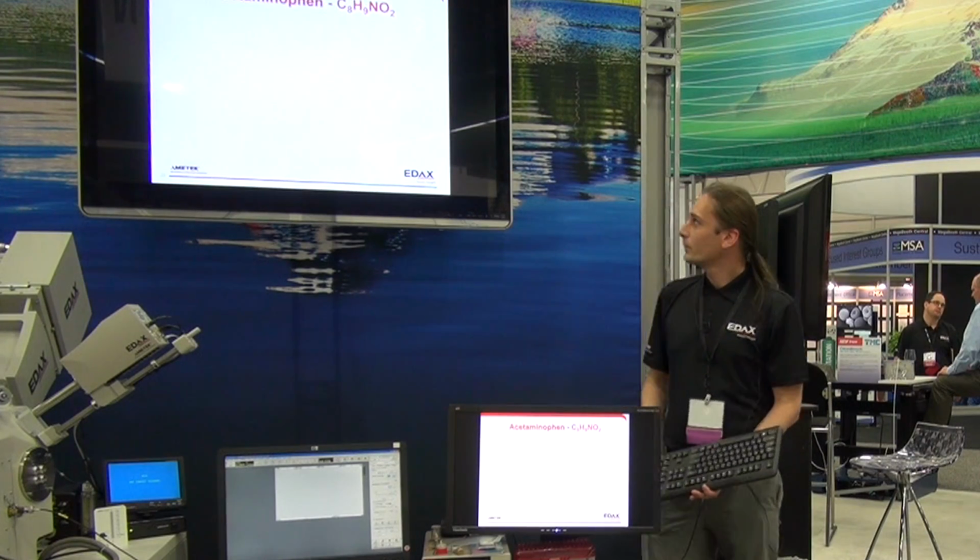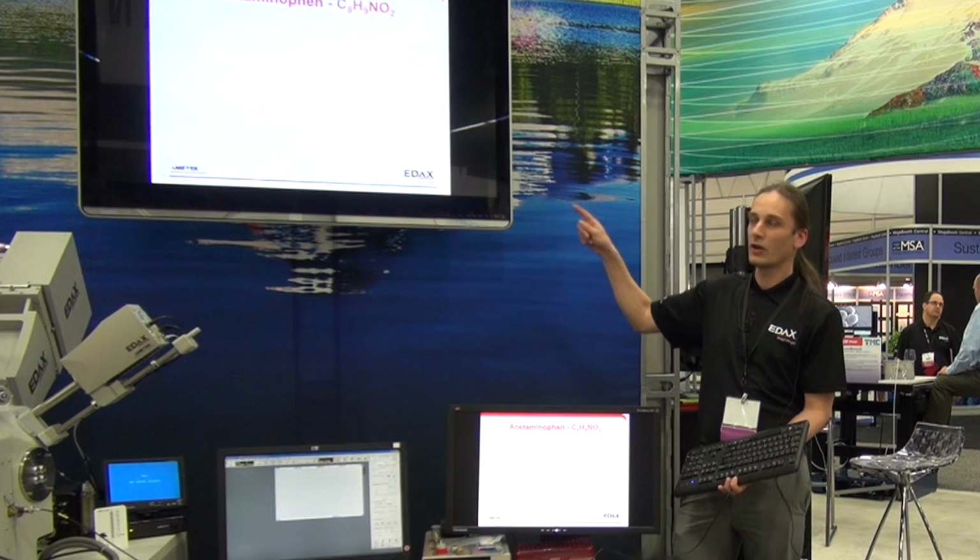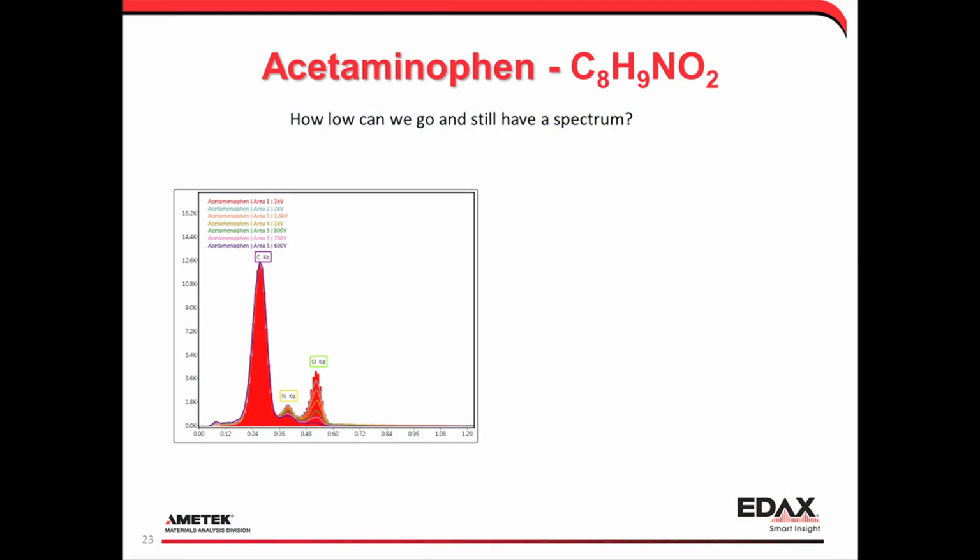Quick look at acetaminophen. This is carbon, hydrogen, nitrogen, oxygen. I use this as an example of how low can you actually go and still get a signal.